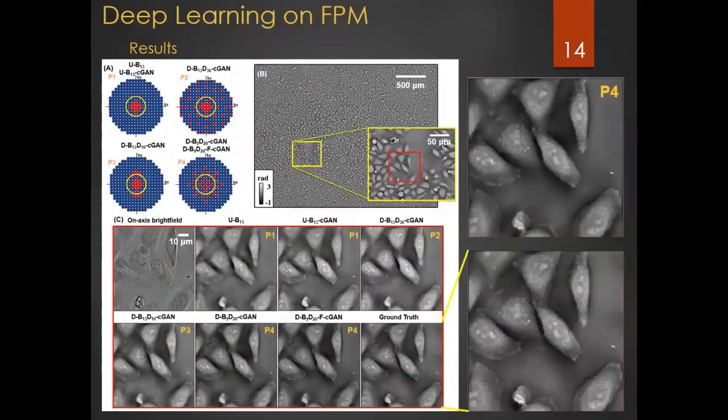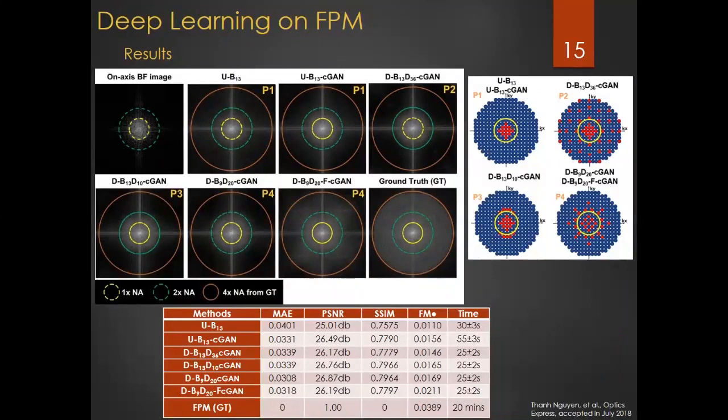For this model, we have very high results, and one of the benefits of using convolutional neural networks is that we have no noise at all in this image. In this phase we can detect the thickness of the cell or any sample we want to measure. In the Fourier domain, we have a very broadband, wider Fourier transform due to the higher frequencies we can reconstruct.